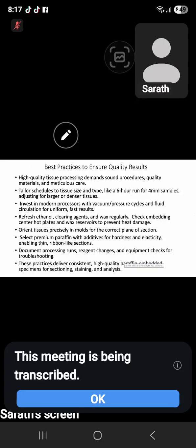Select premium paraffin with additives for hardness and elasticity, enabling thin ribbon-like sections. So, ideal, good quality paraffin wax. Don't use commercial purpose paraffin. Do not use it. Those things are very cheap, but never use them. You have to get the analytical type. Otherwise, you can't get the thin ribbon-like section.